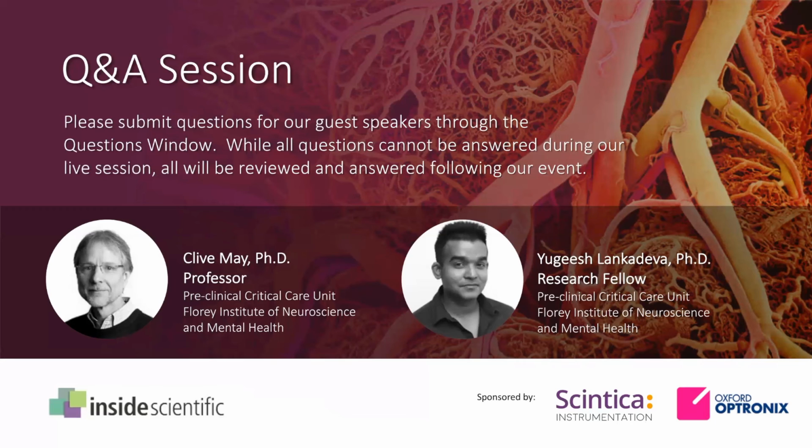Right. That's very interesting because in other large animal situations we've also observed a requirement for sensors to be in place for a period of one or two days, very much in line with what you observed, and thereafter things seem to work very well and generate believable and responsive data. In small animal models, and I'm primarily talking about rodents, it seems to be a very straightforward application, and we don't typically see a requirement for a lengthy equilibration time at all. Generally, in rodents, we often use stereotactic apparatus to maintain the sensor. It is one of the most reliable applications we see for our monitors and sensors.